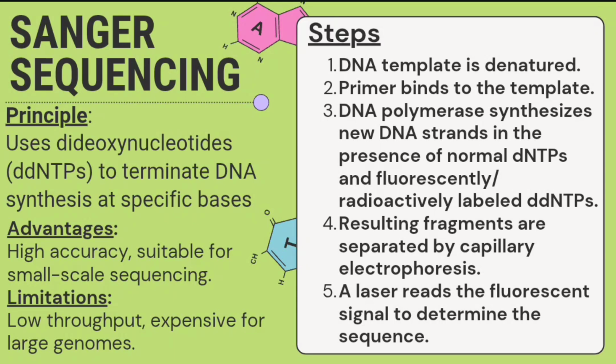This process has some advantages, like it has high accuracy and is suitable for small scale sequencing, but its low throughput or expense for large genomes gives it limited application.